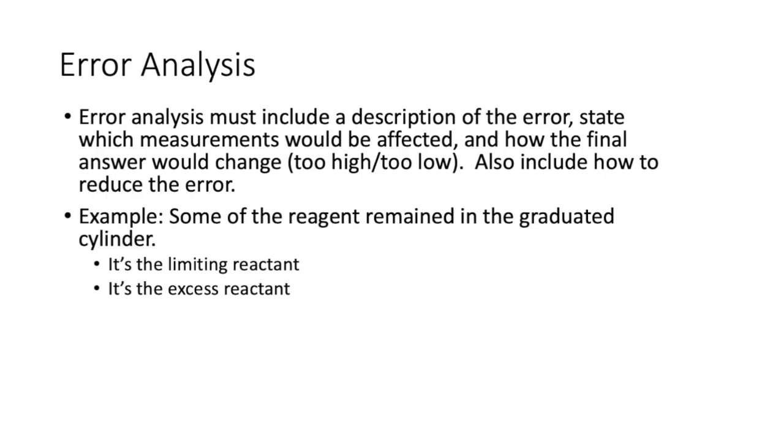One example is you poured the reagent into your DRAM vial, but some of it remained in the graduated cylinder. How would this affect your result? Well, if it's the limiting reactant, then you would have less heat produced from the reaction, because you'd be limiting it more, and then your delta T would be too small, and your delta H would also be too small. But what if it were the excess reactant? If it's the excess reactant, the same amount of heat gets released, but there's actually less solution there to heat up. And so your delta T would be bigger, and your delta H would also be bigger.